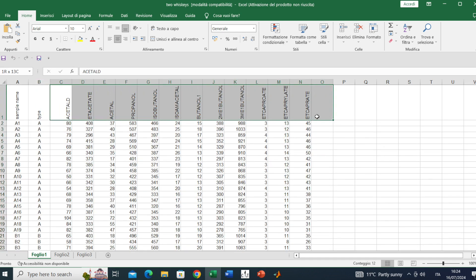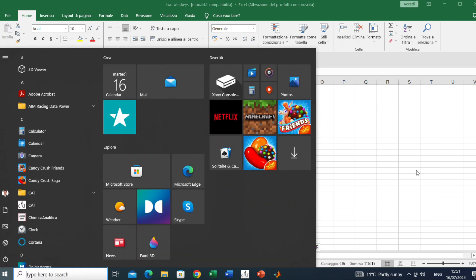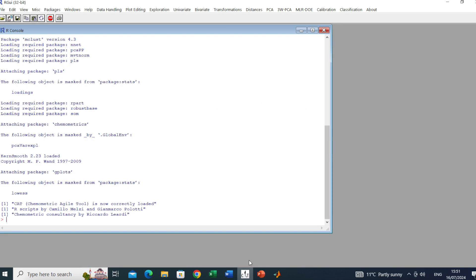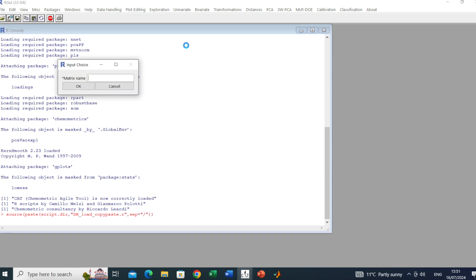Here we have the variables. Chemically speaking, we have 12 chemical components from a GC analysis. Now next step, let's import this dataset into CAT. I'll use the copy and paste option very quickly.